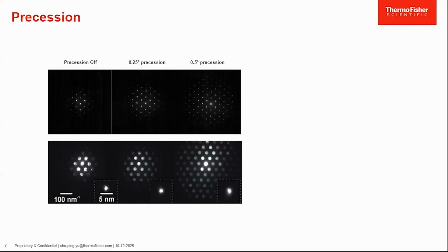And also it wipes out these nasty dynamic contrasts inside of your diffraction disk and leaves you with cleaner ones. So both problems that we mentioned above, the first one being the dynamic contrast, and the second one being only having the diffraction disks closer to the center, are alleviated with precession. So it's safe to say, having precession, we can almost always get a better strain sensitivity.